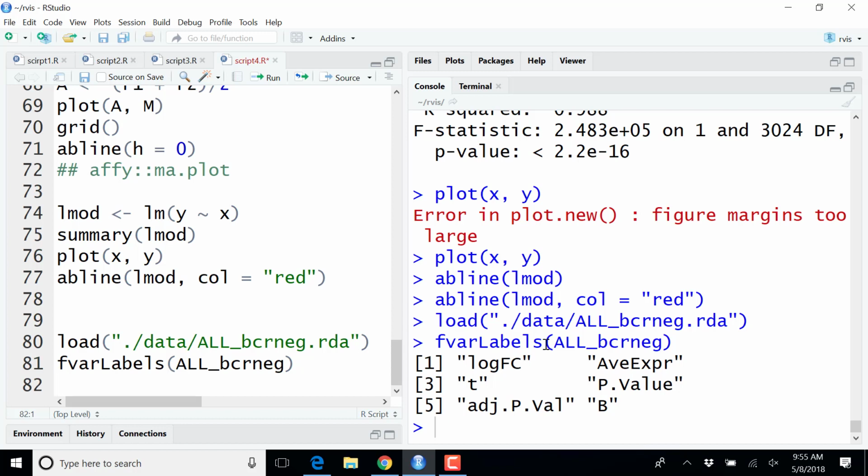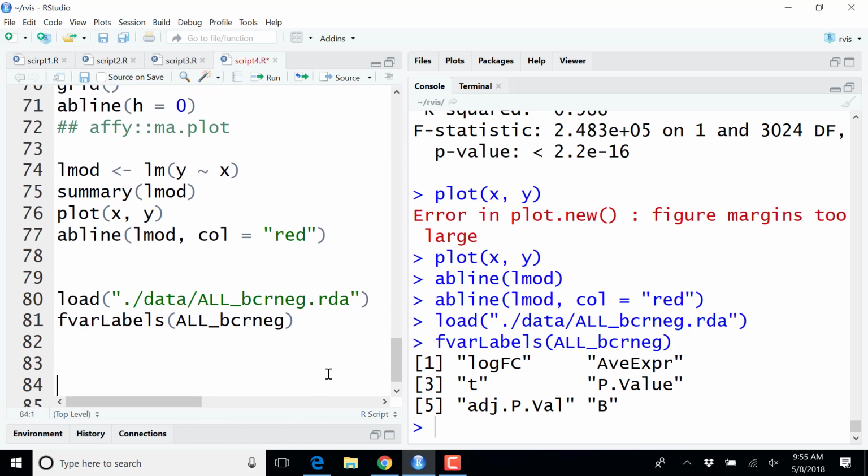This is using a package called Limma, and the code for this is in the very first chapter, where this data set is created. So I have done the test, but before taking the results for granted, it's advised to look at these p-values and look, how do they distribute, how do they behave, to make sure that whatever conclusions we draw are valid.